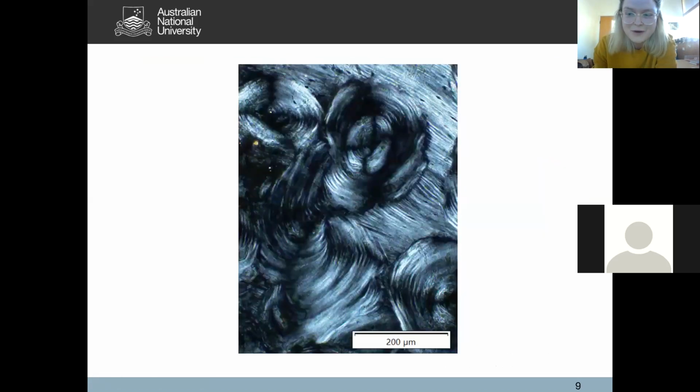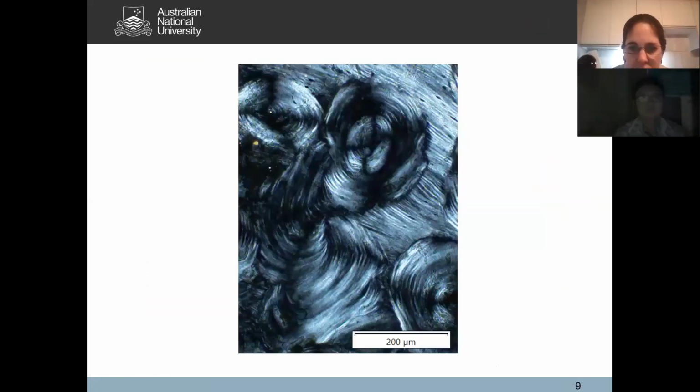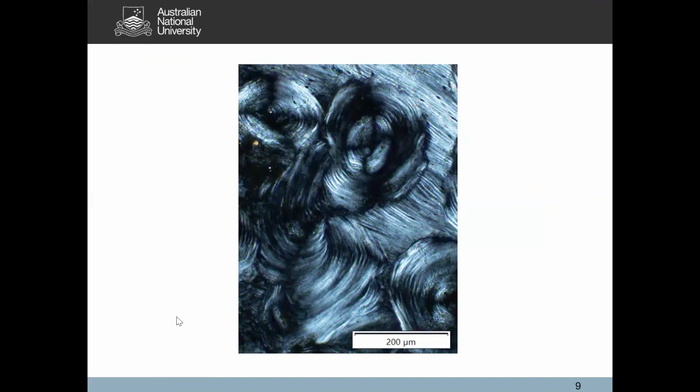Okay, so before we move on, could I ask you to tell me what this osteon here is in this picture? Does anyone remember? So remember, you've got just the surface here and then a tail that's running. What would you call it? Excellent, fantastic. So that's a drifting osteon. So if you see these in your sections, you've got drifting osteons. Thank you. All right, and then the next slide.